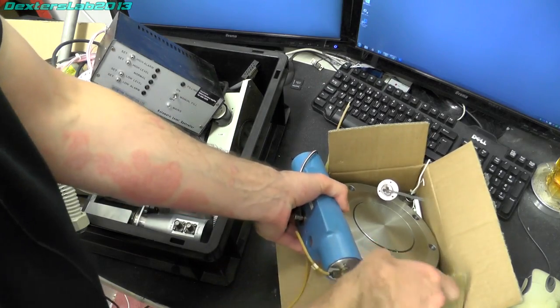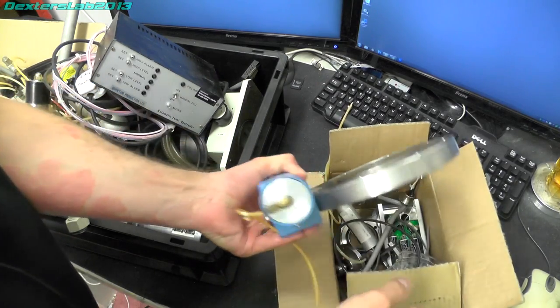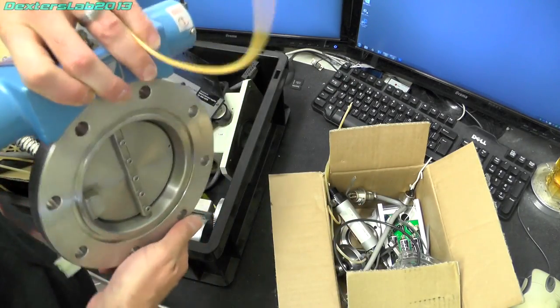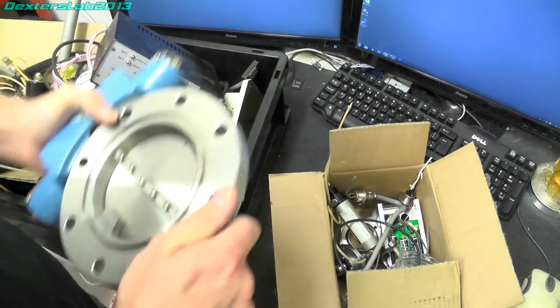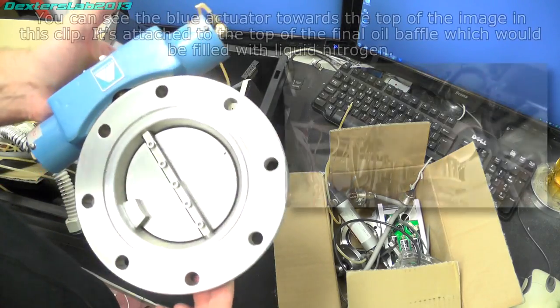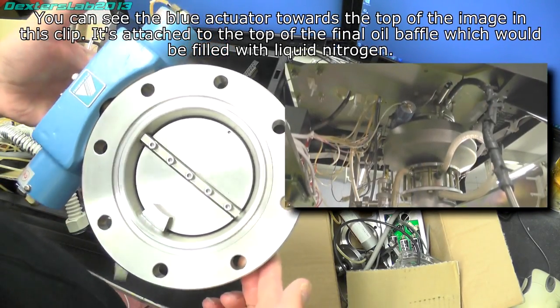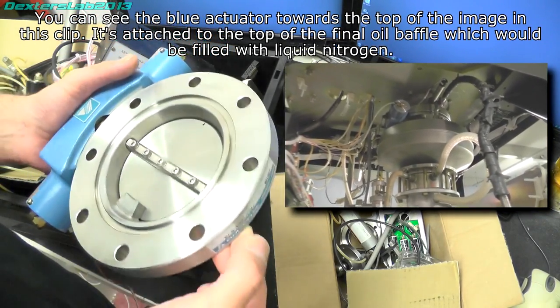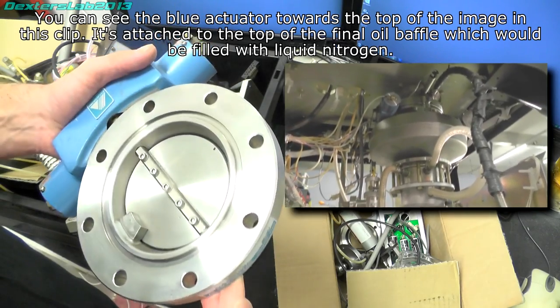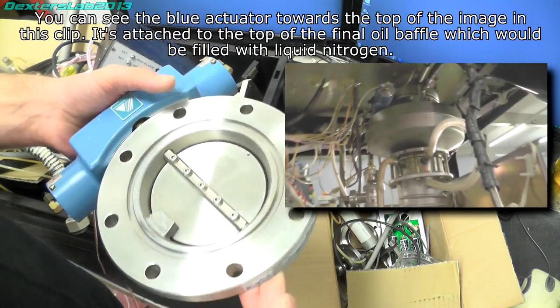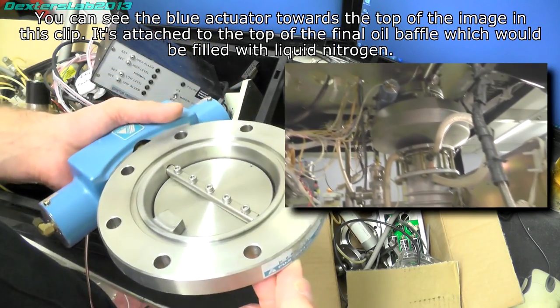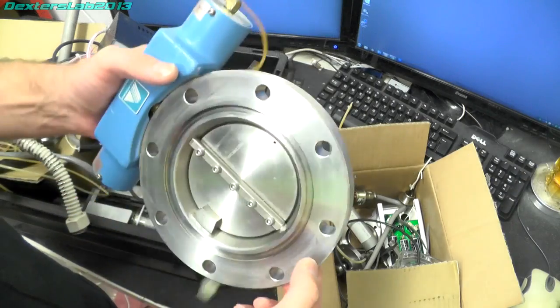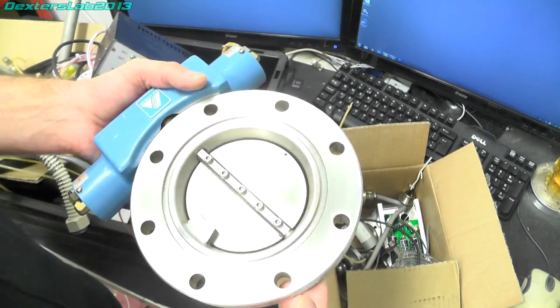Okay the next bit is this rather heavy lump of kit. This was sandwiched in between one of the baffles from the diffusion pump and the base of the actual sample chamber and it's basically just a big valve.